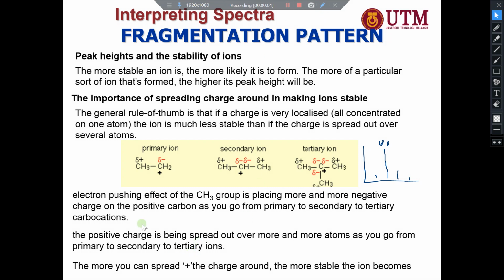Okay, do not get confused here with electronegativity or localization and so on. But for the spread of the positive charge here, if it can spread only to the left, it is not that stable compared to here. It can go left, right, and down, so it is more stable. Alright, let's go to the next slide.